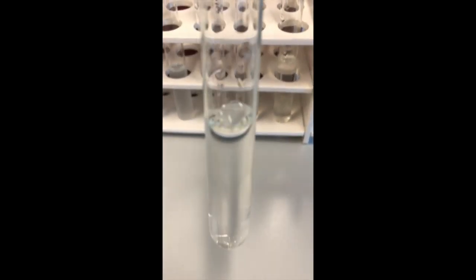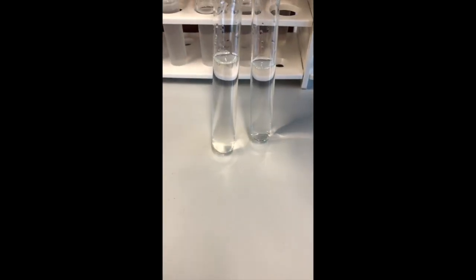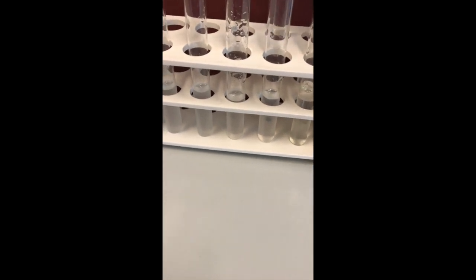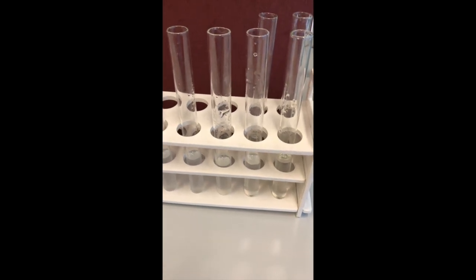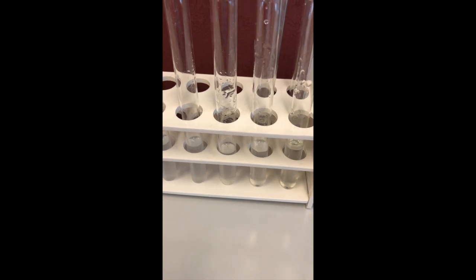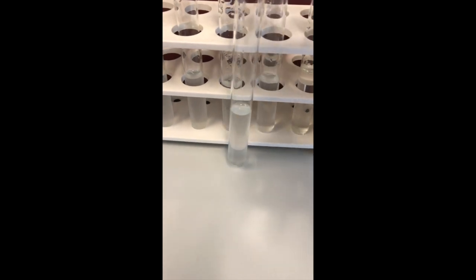The second sample, as you see, is 0, so we don't have sulfur dioxide in the second sample, so our scrubbers collect all the sulfur dioxide, and the first sample is somewhere between 0.1 and 0.2.